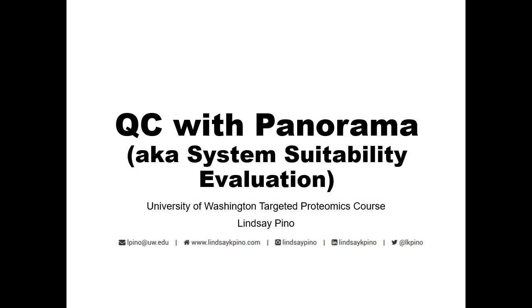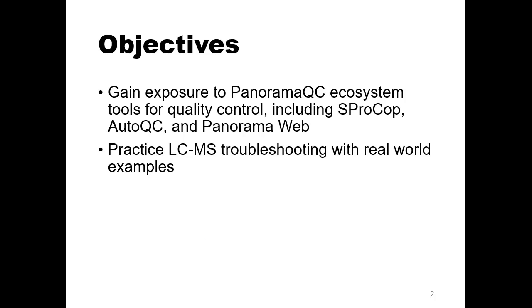Starting a little later, but I'm not too worried because we're going to be able to skip over some of the material in here because Vigisha already told you all about it. We're going to talk about, still staying within the Panorama ecosystem, QC with Panorama. And I say QC, but right off the bat, we're going to talk about how it's not QC, it's actually system suitability.